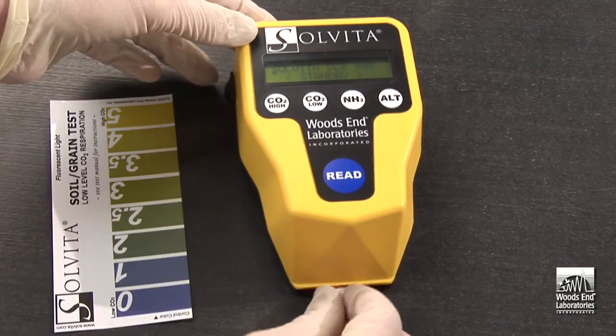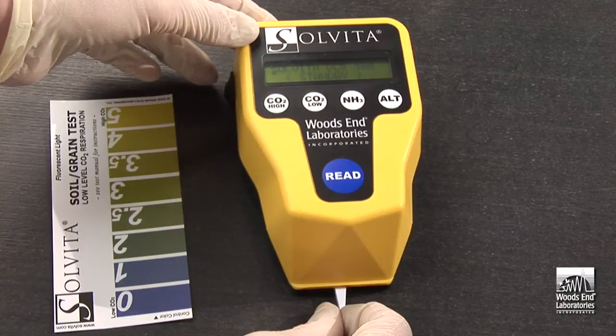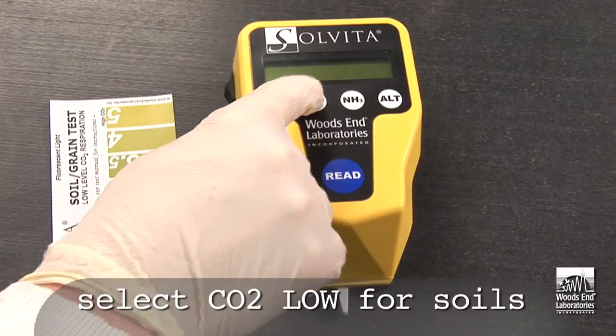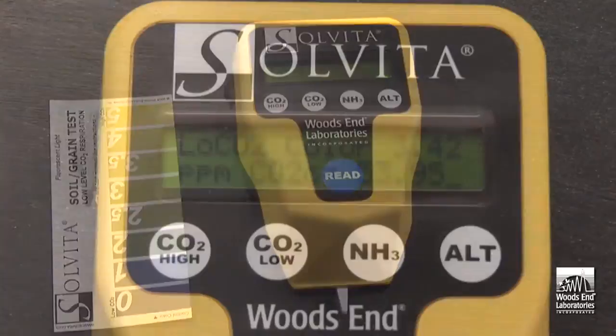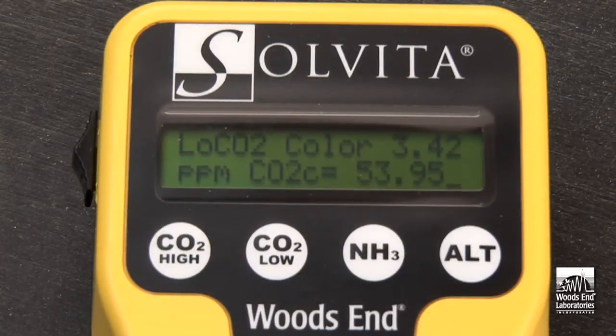To use the DCR, simply insert the probe into the cavity in the bottom of the unit. Next, select the type of test — in this case, the low CO2 range is chosen for soils. Simply press the read button and the results are displayed on the screen. The first line of code shows the exact color units that will match a reading on the color chart. The second line of code shows the CO2 carbon in terms of parts per million. This completes the test.